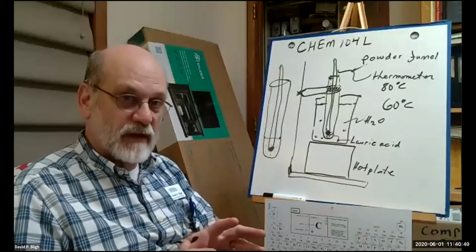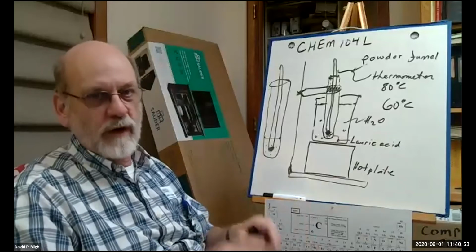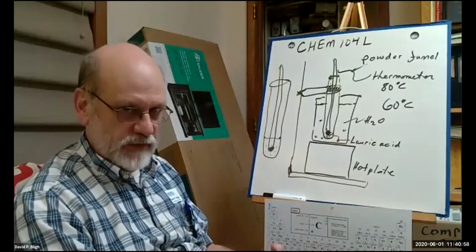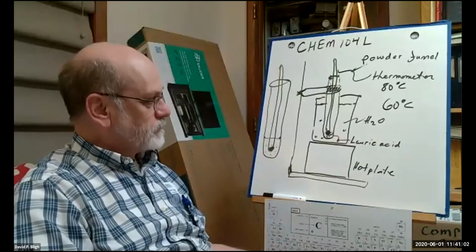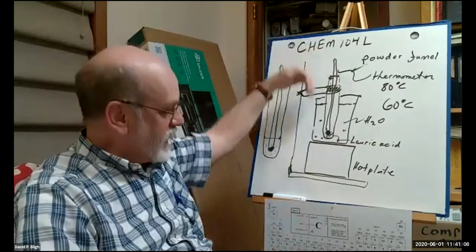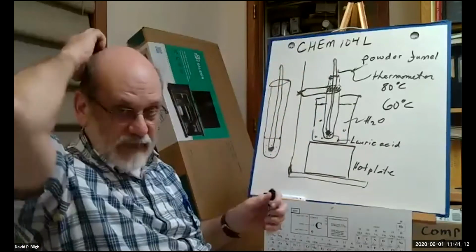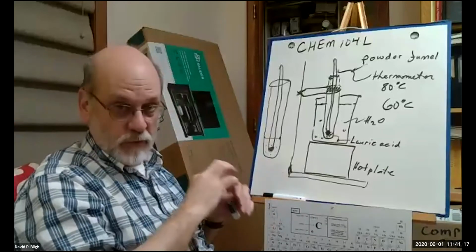And when you measure it, you get the exact value, 1 point something something, with 4 decimal points. And record that. And then you come over here with your powder funnel and pour that in and melt them together. They have to be completely melted and dissolved in one another before you can proceed.